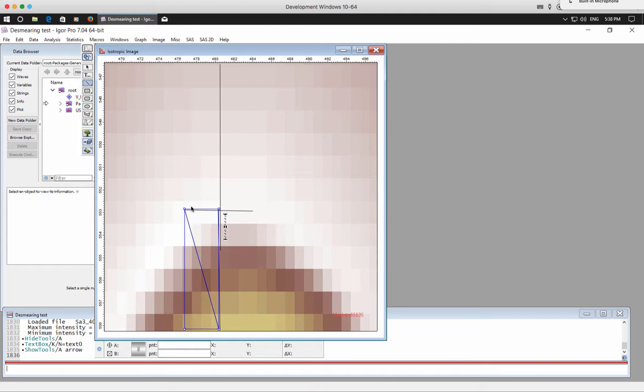And so basically you can think about slit smearing at any Q which we are measuring. It actually measures not only that Q, but it integrates over a slightly larger range of Qs. How far in Q it integrates depends on what's called the slit length. In other words, this distance from this straight line towards the maximum angle which it collects, to the maximum pixel here, is called the slit length.